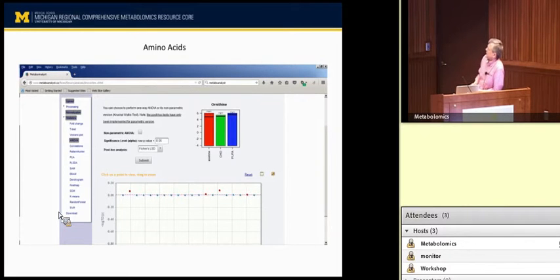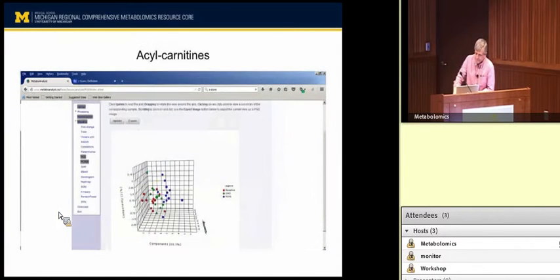This is, I forget, it'll come to me in just a second. Aminoisobutyric acid. It's a minor amino acid. It's probably related to bone turnover. Why that's up a little bit, it actually is up a little bit in the carbohydrate diet.